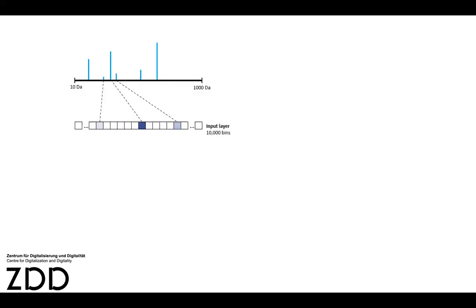But the way we do this is the following. We have the fragmentation patterns, and with high precision this is not handleable for most machine learning tools. So what we do is a binning step, where, okay, this is a bit crude, right? We lose information, but we have to do this. We put the peaks into, let's say, 0.1 Dalton wide bins, and you get a vector from this. At the place where we have these peaks, you get some value in each array of numbers, and this value will be the intensity of such a peak.